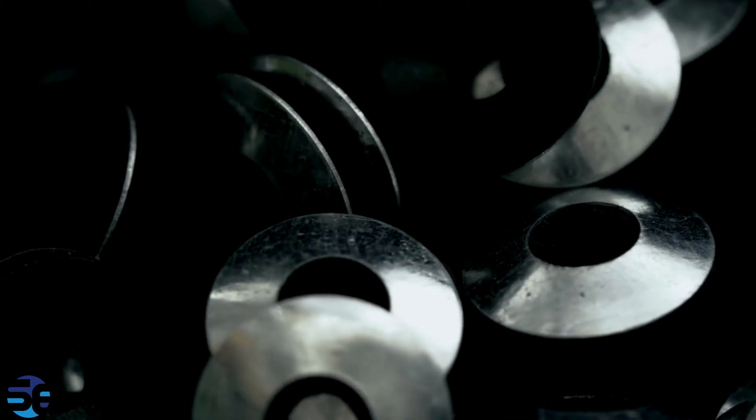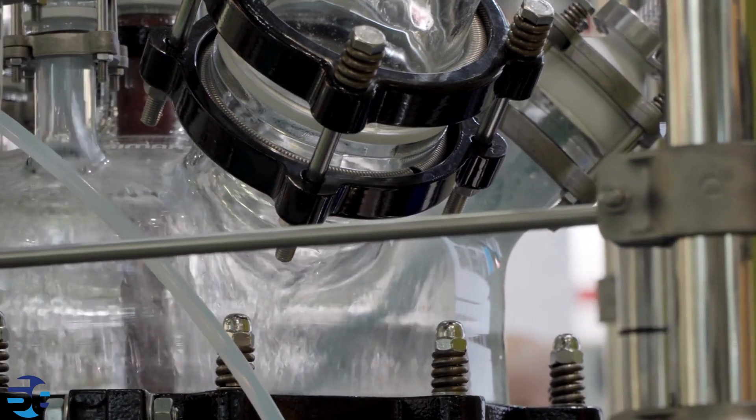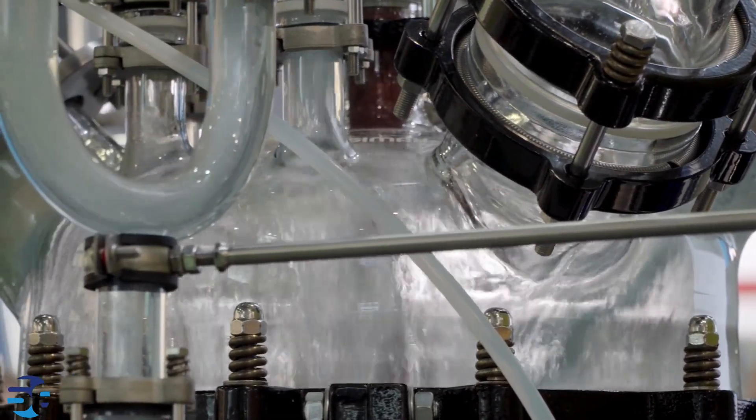Let's understand the stirring mechanism. To ensure uniform mixing of reactants and facilitate heat transfer, autoclave reactors often include a stirring mechanism. This can be an agitator or magnetic stirring, depending on the specific design.